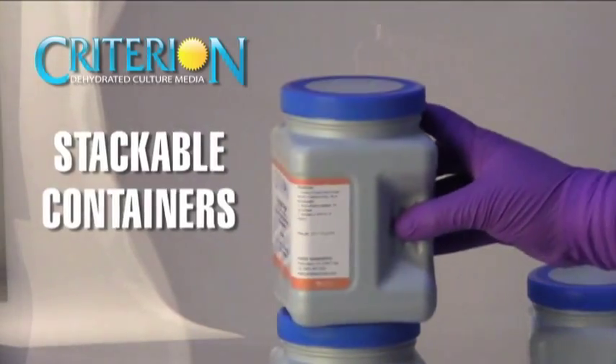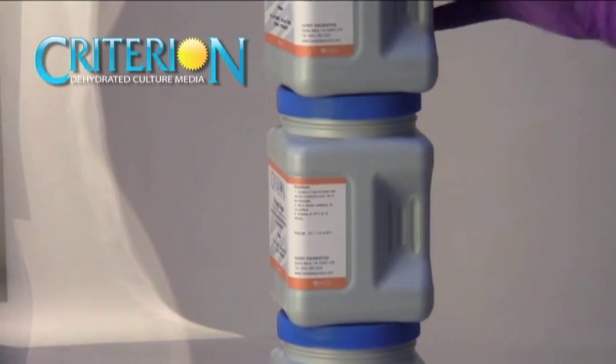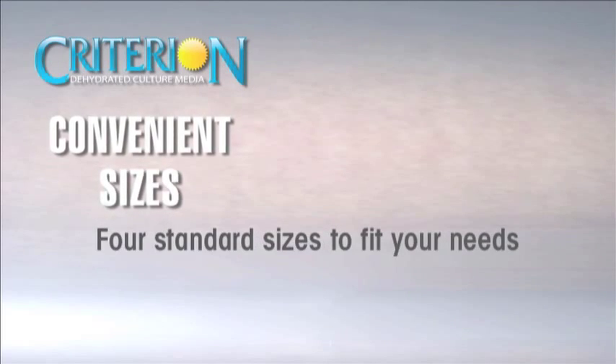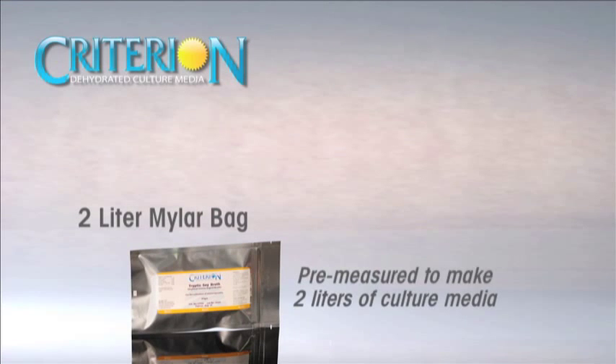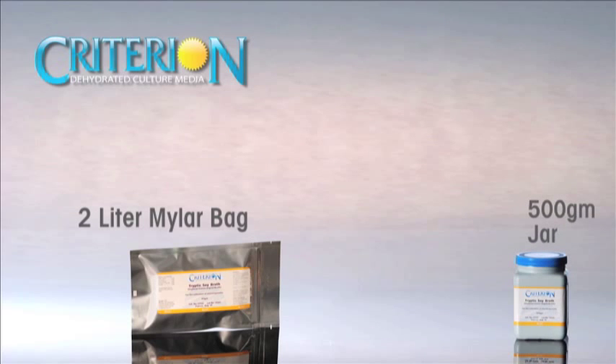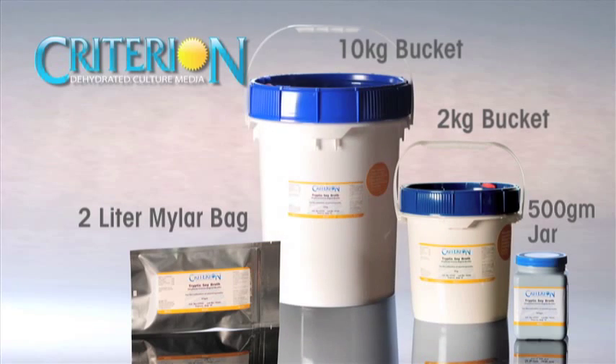Jars and buckets have a nested design and are stackable for efficient and economical storage. Criterion is packaged in four standard sizes to fit your needs: a 2 liter mylar bag pre-measured to make 2 liters of culture media, a 500 gram jar, a 2 kilogram bucket, and a 10 kilogram bucket.